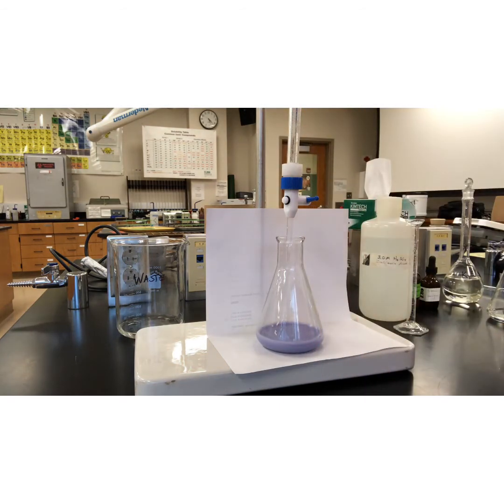Is my arm totally in the way of the camera? Okay. So we've got 19.5, 19.6, 19.73. Final volume was 19.73 milliliters. My first titration. So that's titration 1. Final.